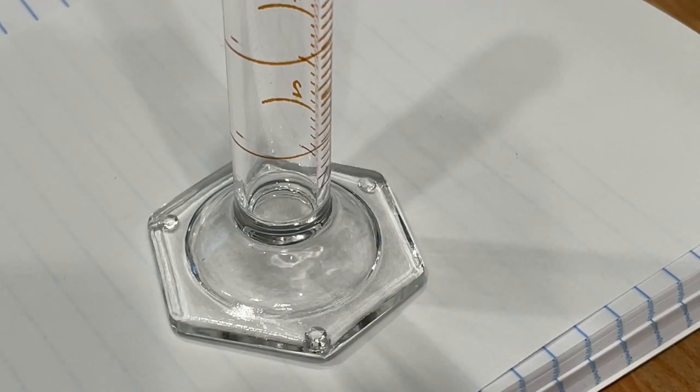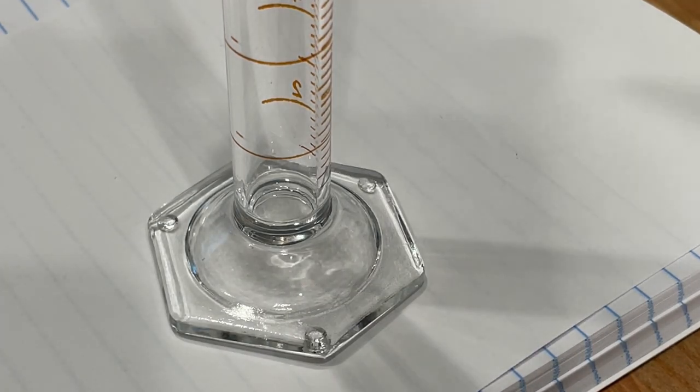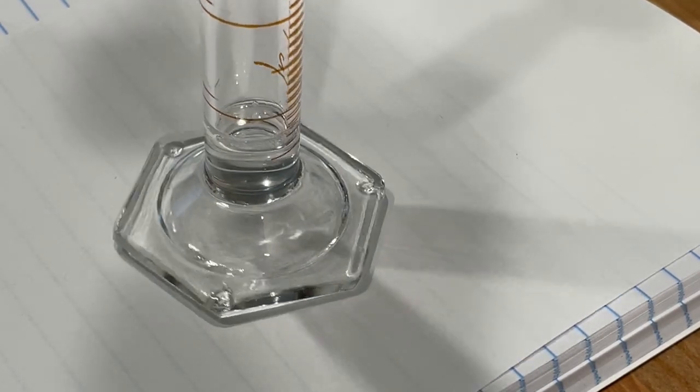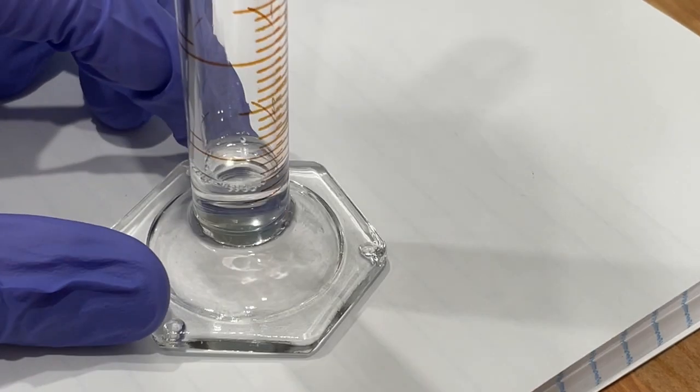After this, all the mixtures are ready, and all that remains to be done is to mix them all together in equal volumes. I ran several trials where I mixed 1 milliliter of each mixture together to try and recreate the reaction.